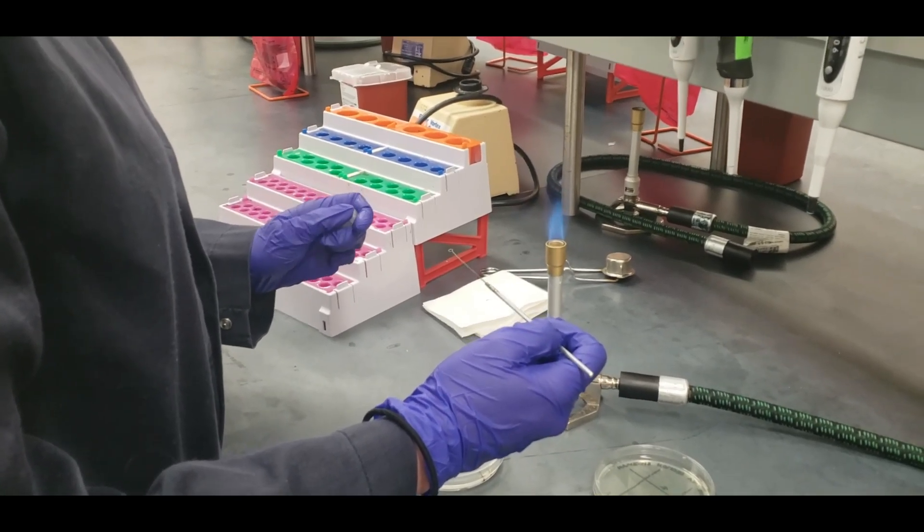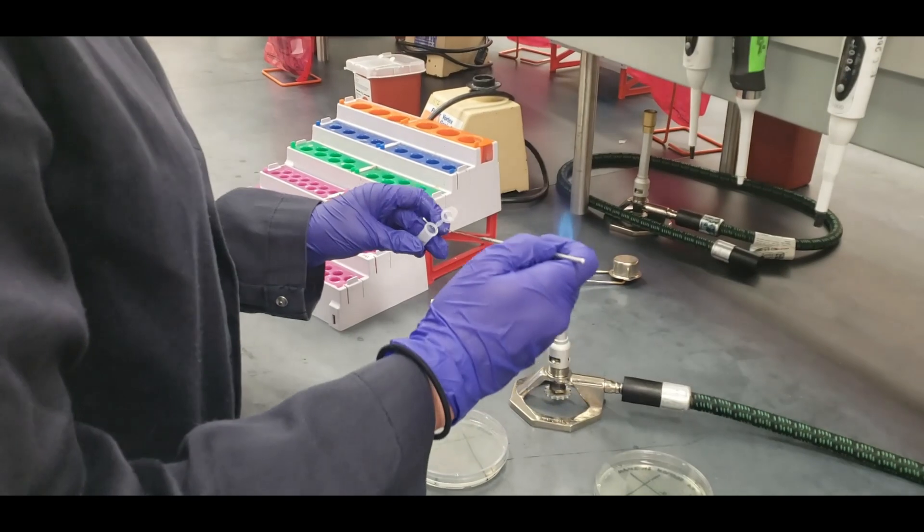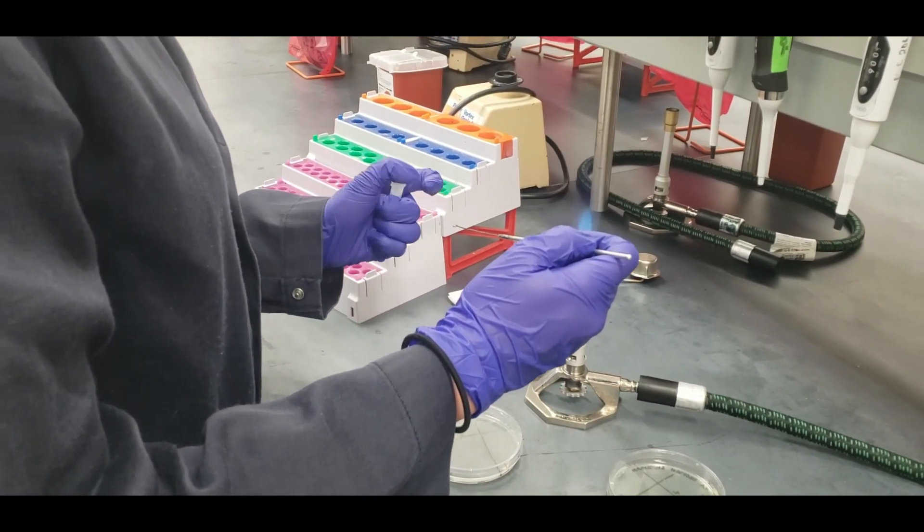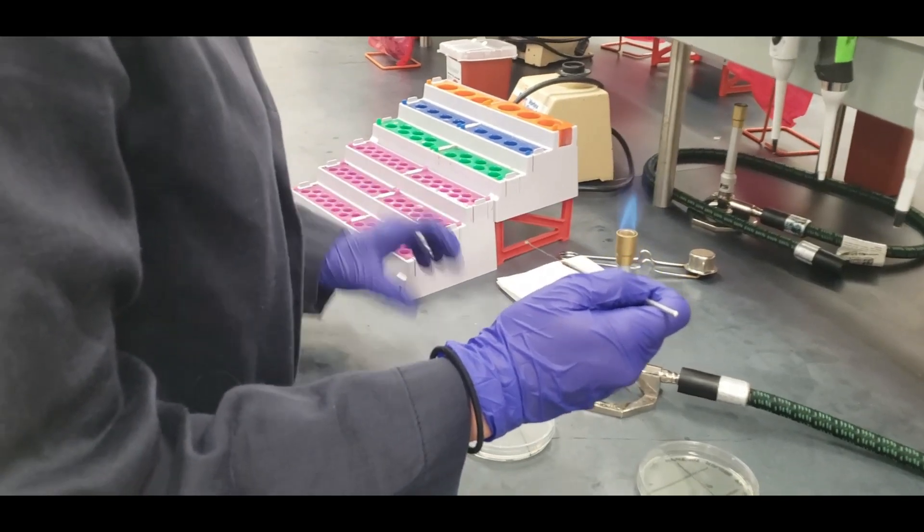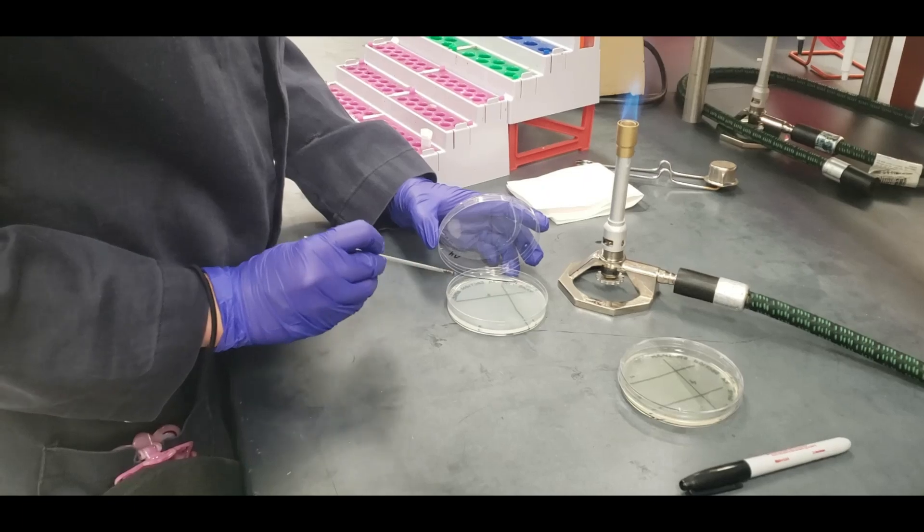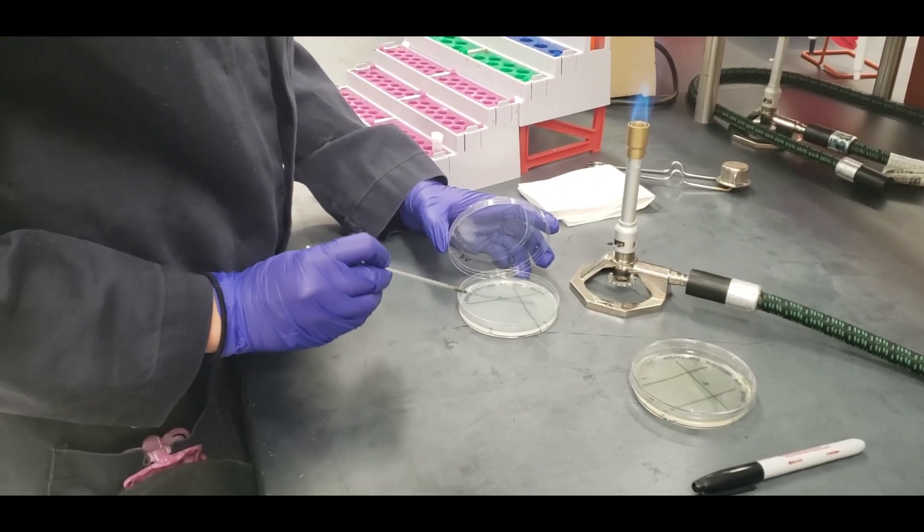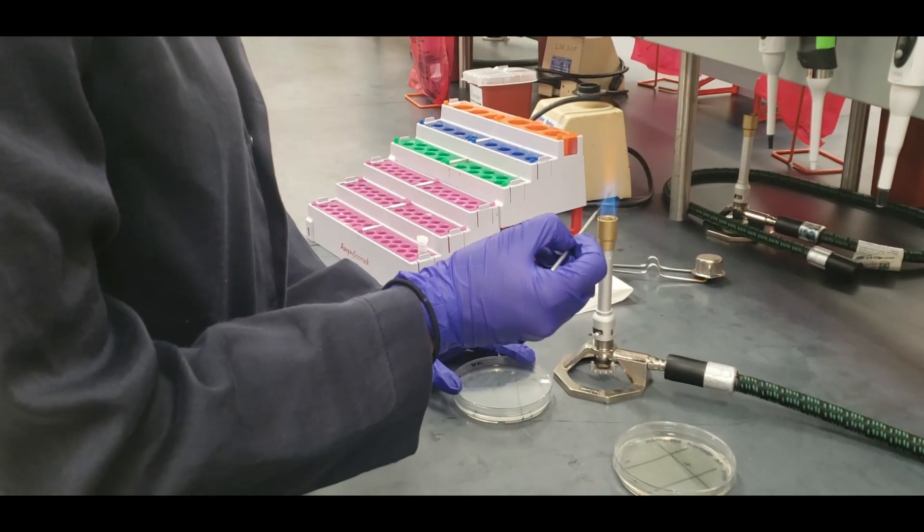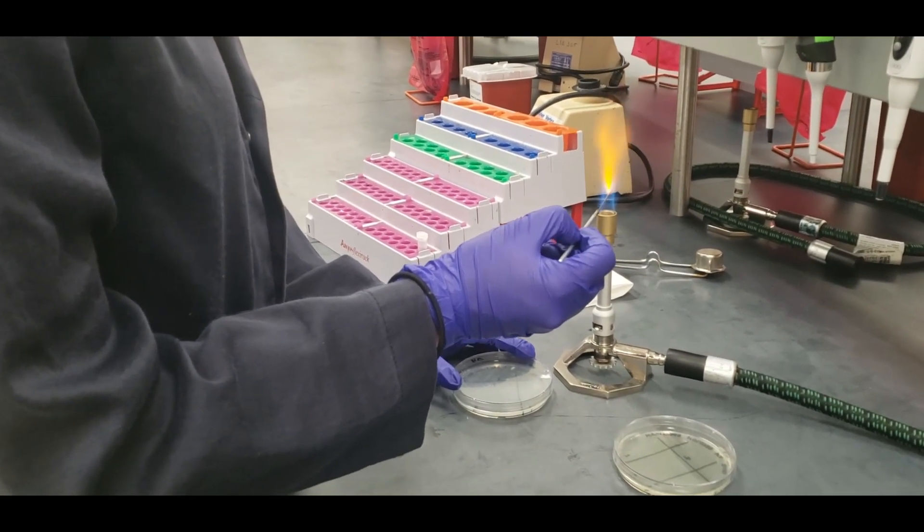You're going to stick your loop in your culture one time and streak the first section. Flame your loop, completely sterilizing it once more. Don't forget to let it cool.